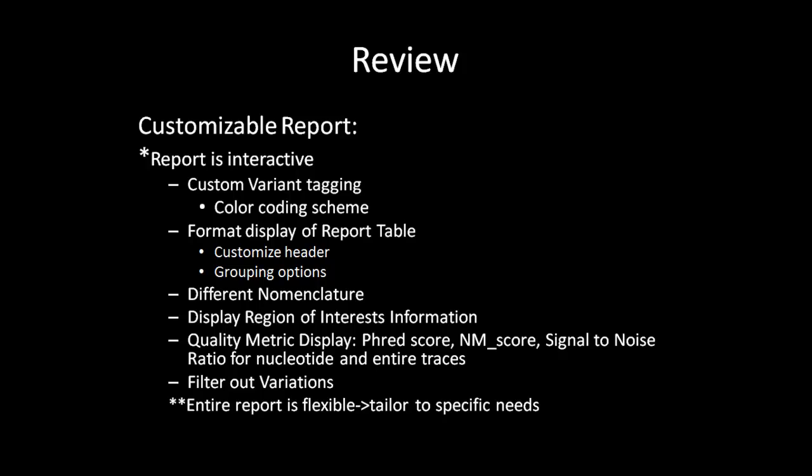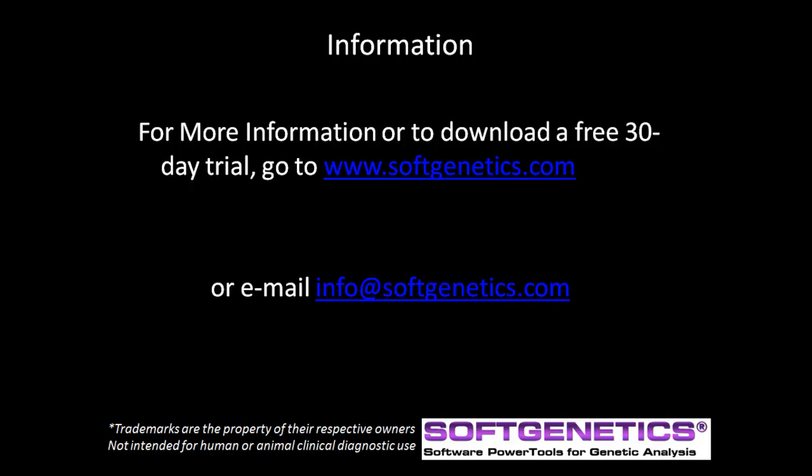Other types of reports are discussed in the introductory webinar and in Chapters 4, 5, and 6 of the Mutation Surveyor Manual. This concludes the SoftGenetics reporting options with Mutation Surveyor webinar.